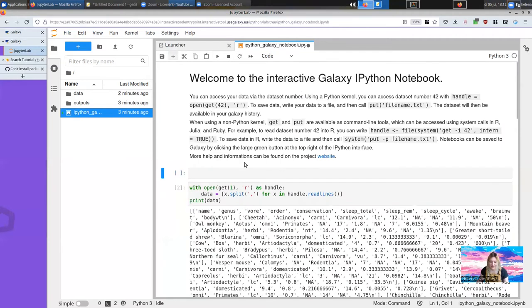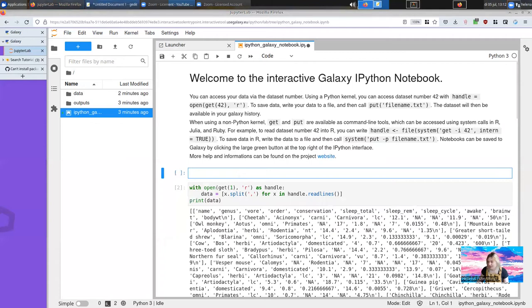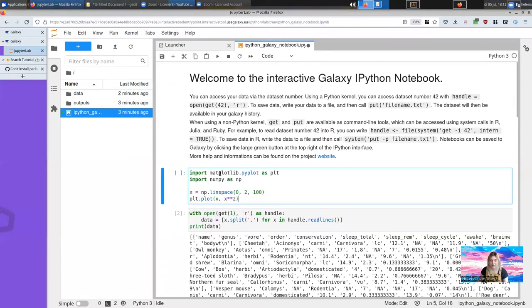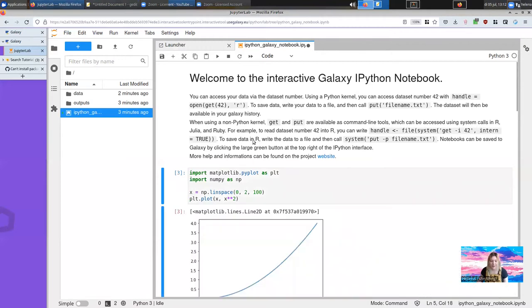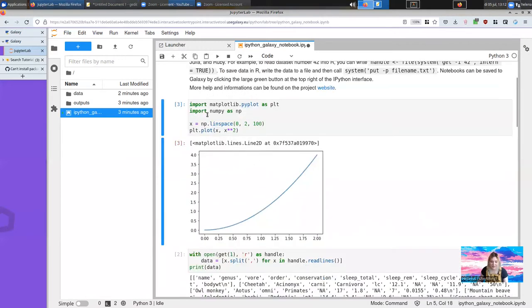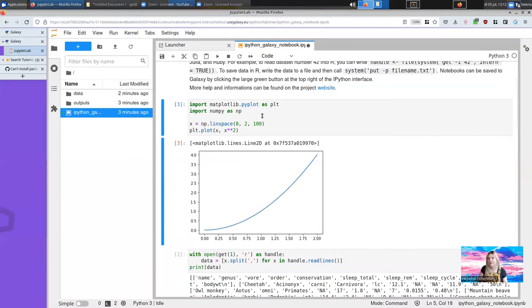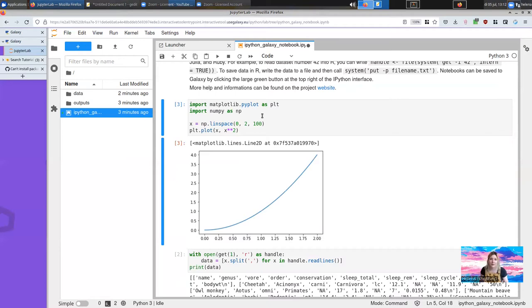Let's add a new cell. You can even do things like plotting. If you have some matplotlib or some numpy plots that you want to make, these are easy to do in the notebooks as well. Things that you just can't really do in Galaxy because you don't have access to all the configuration parameters. But here in the notebooks, you can do whatever you'd like to in Python.